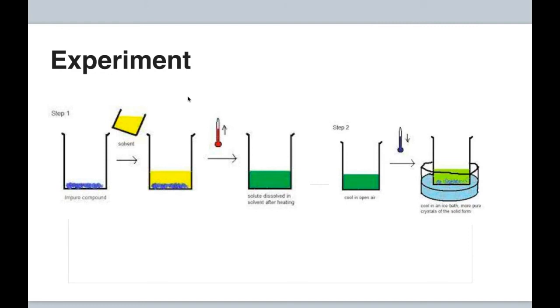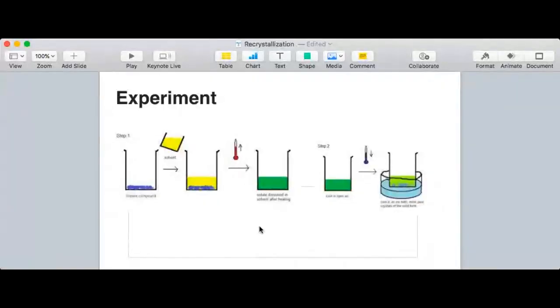But there should be, prior to this very first step on the slide, one more step, as you all know, right? Also, the first step when you dissolve, the slide is giving a little misconception as if you are pouring the whole solvent at once. That's not true. It's a very inaccurate method. As you all know, we are boiling the pure liquid, and then we are adding it little by little to have just enough to dissolve, right?